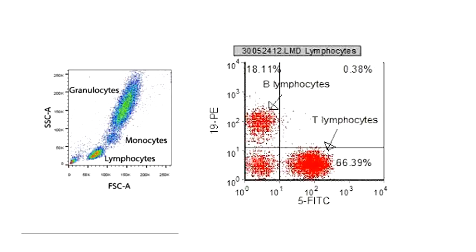Again, one dot is equal to one cell. I have some population here, then I have some population here. So we have three populations. I can divide the graph into quadrants. Right? I can just select it again like Microsoft Paint. And people who have seen the Ramachandran plot know there are 4 quadrants. Similarly, in this graph we have 4 quadrants.